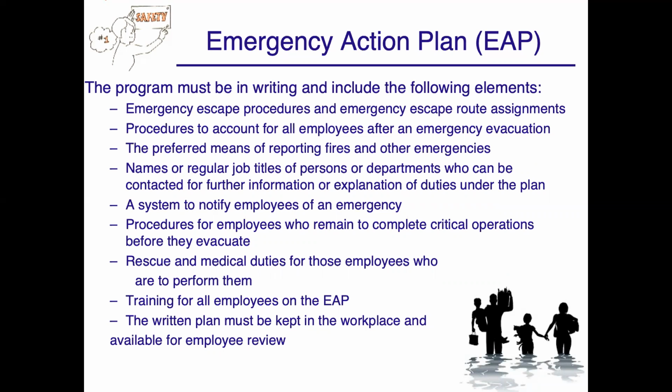names or regular job titles of persons or departments who can be contacted for further information or explanation of the duties under the plan, a system to notify employees of an emergency, procedures for employees who remain to complete critical operations before they evacuate, rescue and medical duties for employees who are to perform them, and training for all employees on the EAP. The written plan must be kept in the workplace and be made available for employees to review.